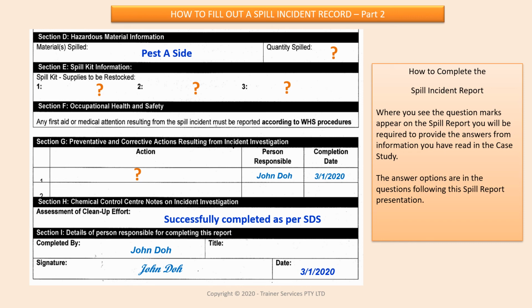In order to complete this spill incident report, where you see the question marks appear on the spill report, you will be required to provide the answers from the information you have read in the case study. The answer options are in the questions following this spill report presentation.